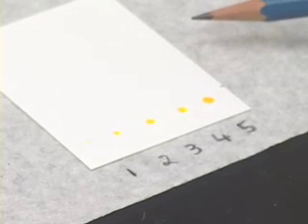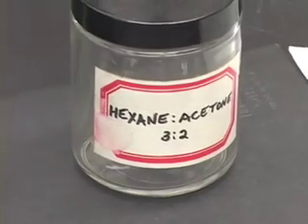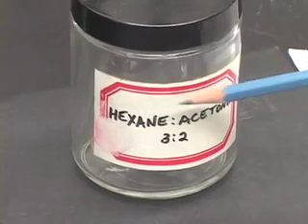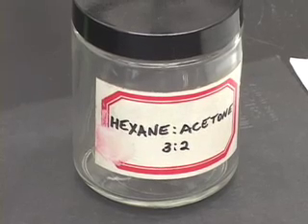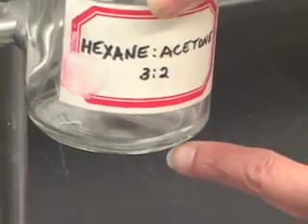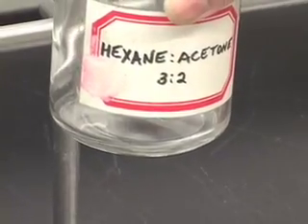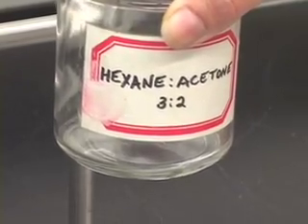Now this TLC plate is ready to be developed. This plate will go in the developing jar which will have the developer. The developing solvent we are using for the colored unknown is hexane acetone in a 3 to 2 ratio. You notice that there is a convex surface at the bottom of the jar. You want to take just enough solvent to cover that convex surface, maybe a few drops extra but not much more than that.